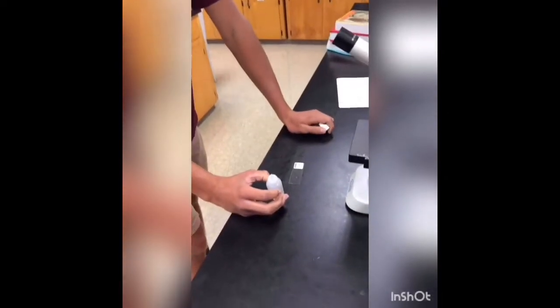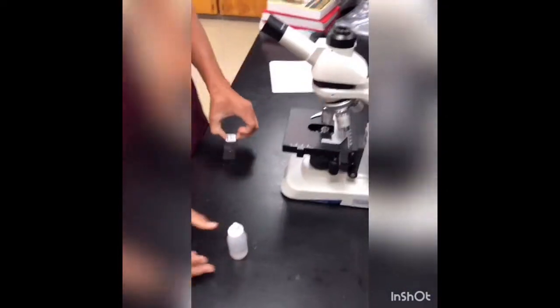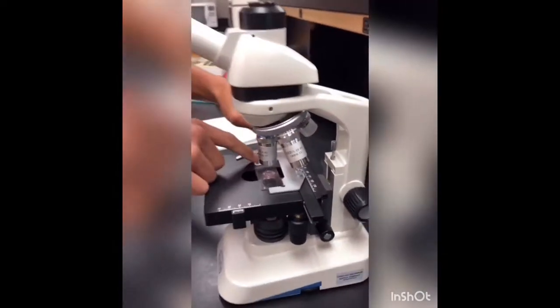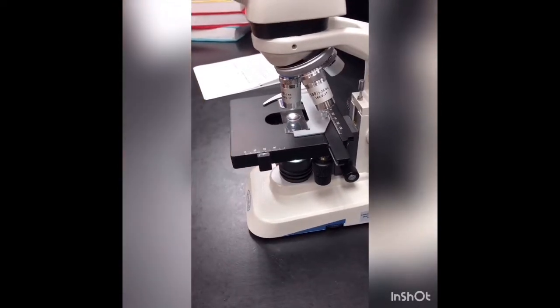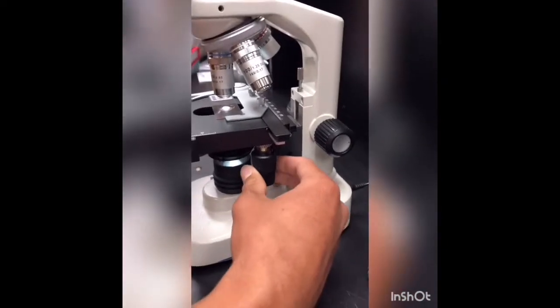Okay, so once you're done with steps 1 through 19, you want to take some oil and put it on your specimen. And then you want to put your slide back onto the microscope and make sure it's locked into the microscope fully and not going to slide around at all. And then you want to turn the microscope on and use the fine adjustment knobs to make sure it's good.